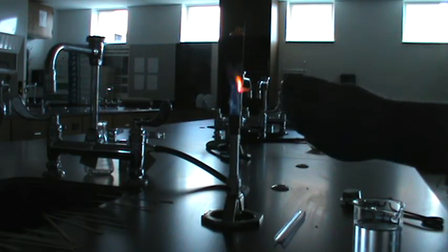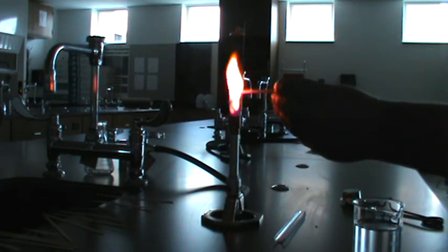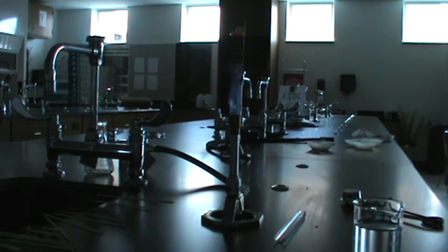And let's go ahead, and here is unknown number 1. Here is unknown number 2.